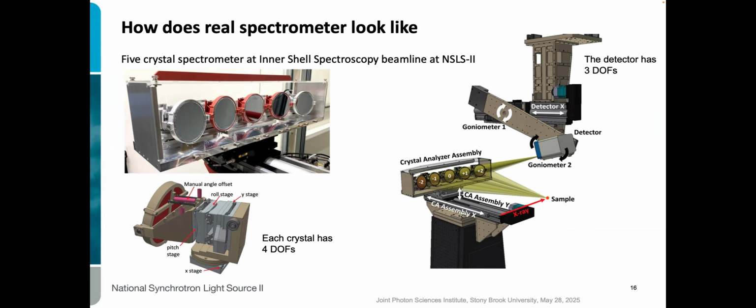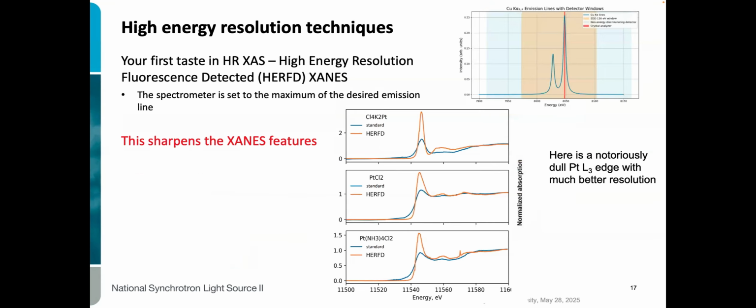And then each crystal has 4 degrees of freedom. We have to move it left and right, up and down, and rotate it in 2 directions. So it's a really complicated motion, but we know how to do it. You don't have to care. It's just that sometimes when things go badly, something doesn't work, please understand. It's a complicated problem, and we're trying to help. All right?